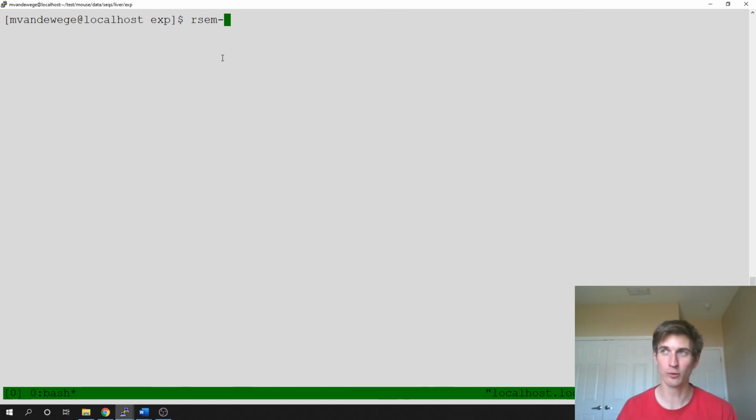So that is mapping to a reference genome and then using the coordinates to understand what genes those reads came from. The alternative is what I'm doing today, mapping reads directly to a gene set. There are probably some arguments of what's better or worse. Not going to worry about it today.